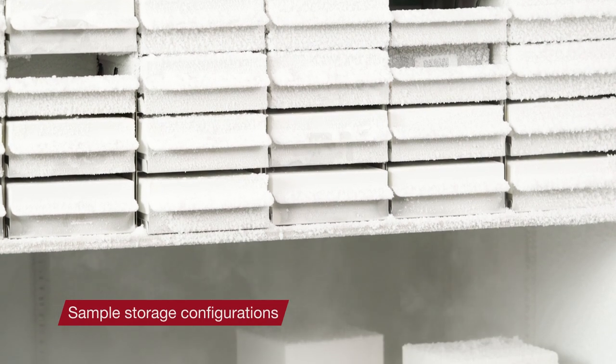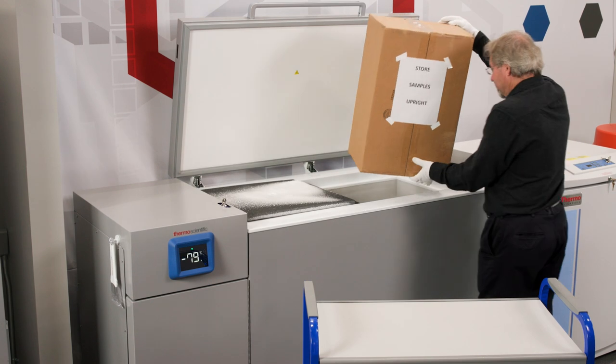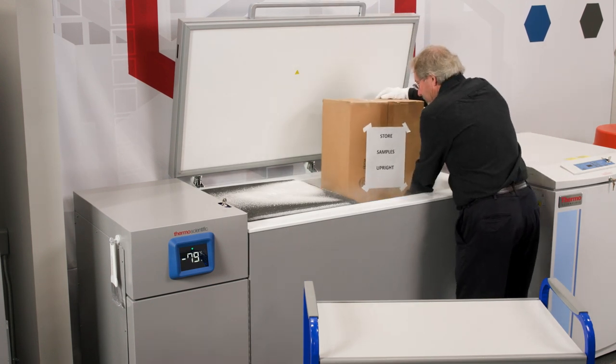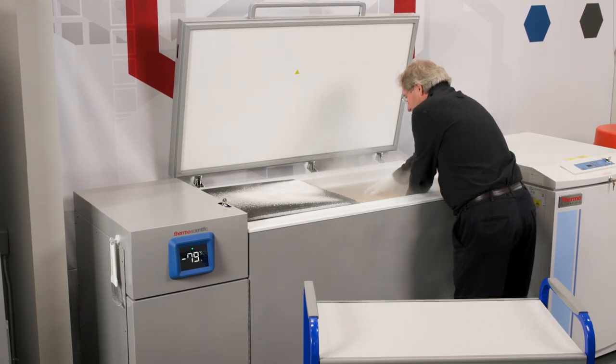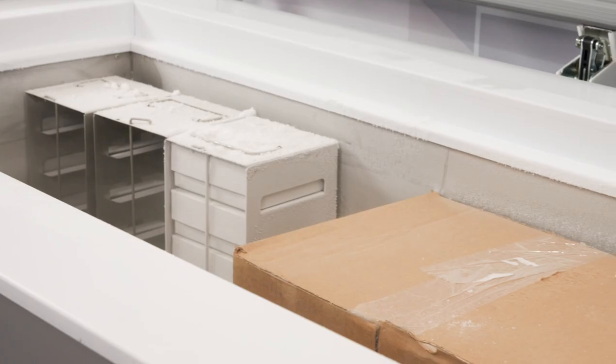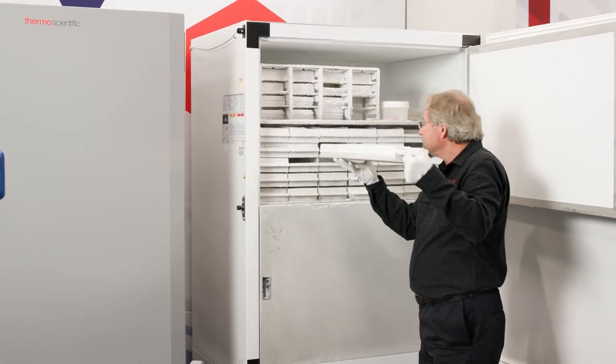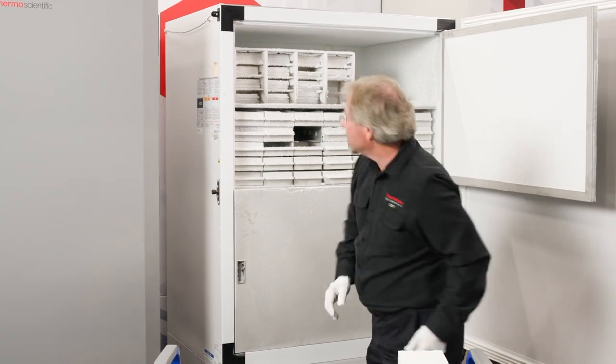Are they identical or in the same packaging? Or will your freezer need to be flexible enough to accommodate many sample packaging configurations? Special racks can make sample retrieval much more efficient, but in many cases, you may need open space to store bulk products. That's where the weight of the sample comes into play. You'll want to think about the physical nature of retrieving the samples once they're stored.